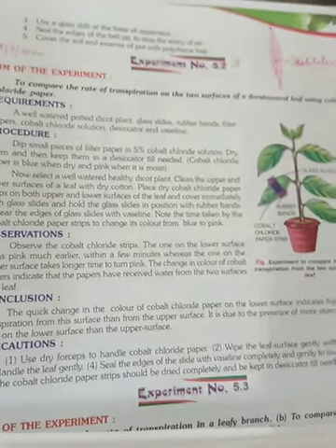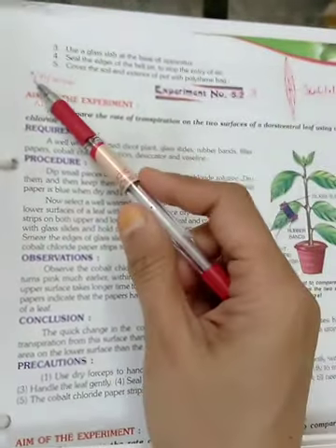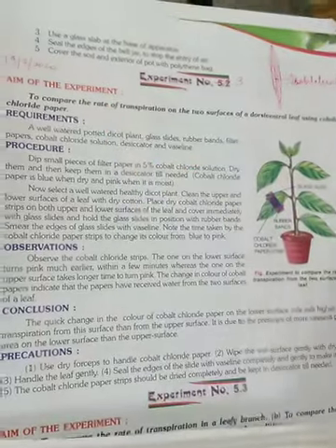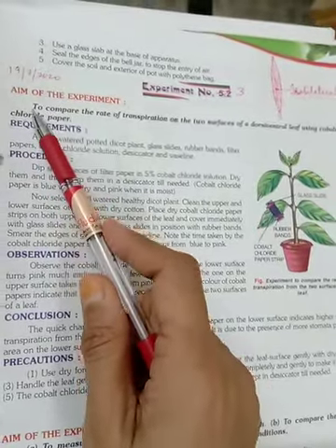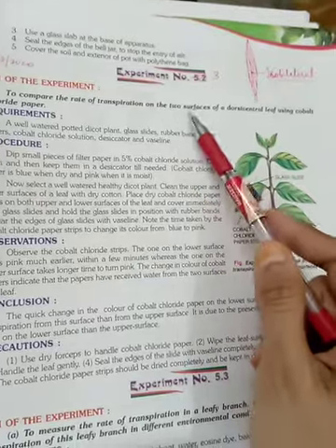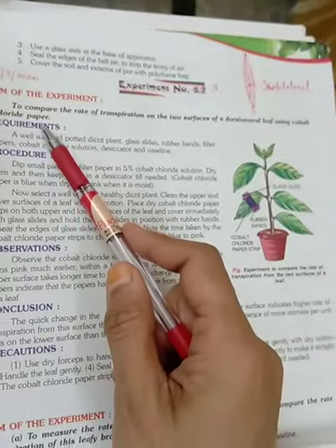Good evening, children. Today we will do practical number 3, and as usual on a new sheet you'll write down today's date, 19/7/2020. Today's practical is also on transpiration, where the aim of the experiment is to compare the rate of transpiration on the two surfaces of a dorsiventral leaf using cobalt chloride paper.